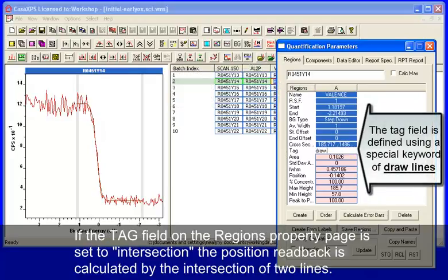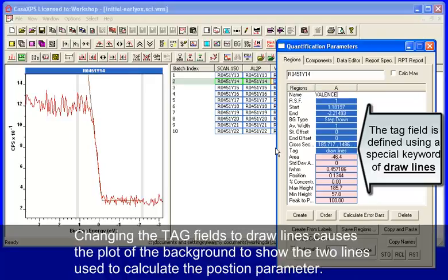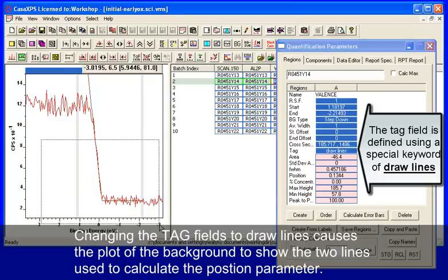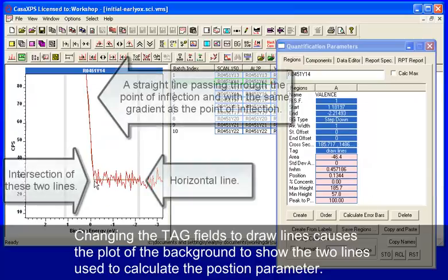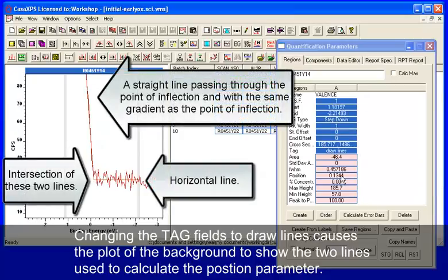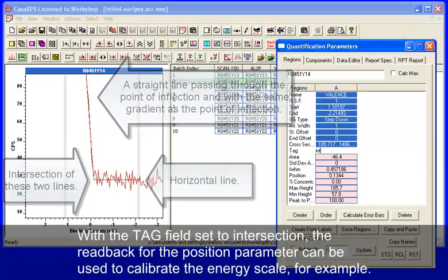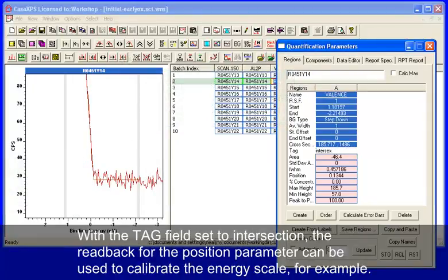So we can see where the intersection occurs. Having obtained this intersection of these two lines, which represent the position for the error function, we can then use this to calibrate a set of spectra.